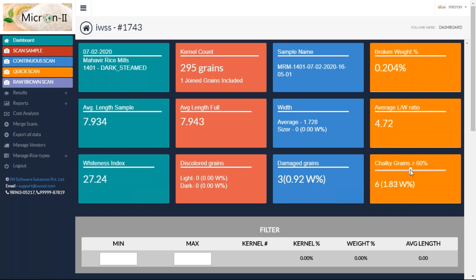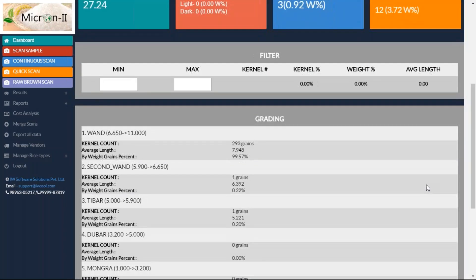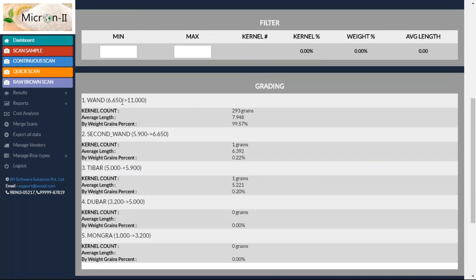We have kept the chalky threshold flexible. You can select how much part of a grain is chalky before you consider it as chalky. If I set it at 50 percent, then 3.72 percent of your sample is chalky. When I go further, I can see that the sample belongs to the one category — that means the long grain category. Above 6.65 mm is defined as one in my setting; you can customize that. 99.5 percent of the grains belong to this category. 0.22 percent — just one grain — belongs to the second category, and that one grain is the broken grain belonging to the Tibar category.